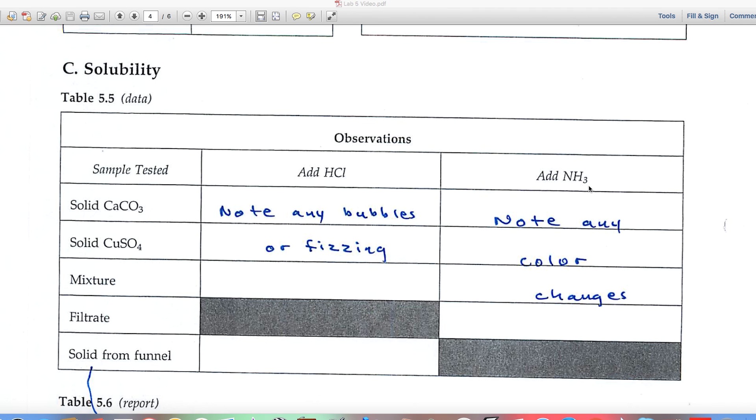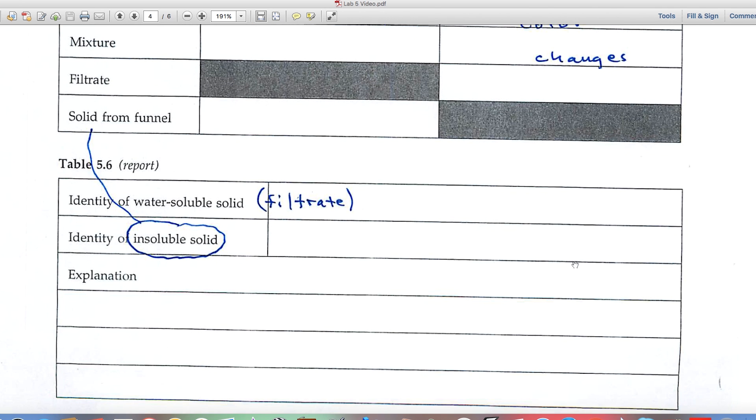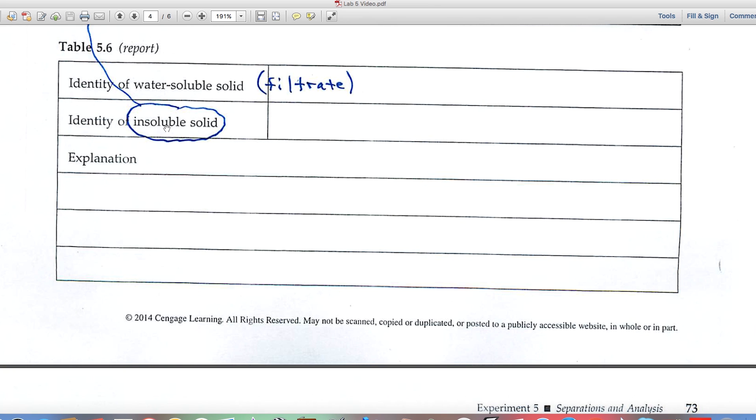Over here we'll be adding NH3, and this time it produces a color change. So note any color changes. And you'll be testing the filtrate and see what color is produced and whether it correlates with the copper sulfate or the calcium carbonate. Use that information to identify the water soluble substance, the filtrate, and the insoluble solid that collected in the funnel. And of course the explanation would be that the behavior of the insoluble solid acted like whatever it is that you identified it as, and the same with the filtrate, that its behavior acted like the other one.